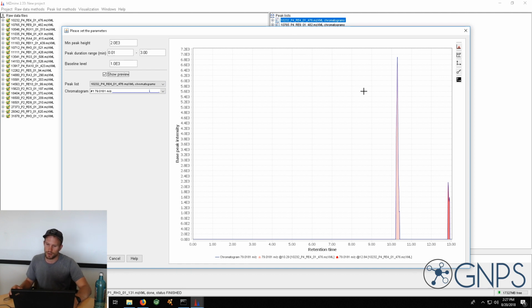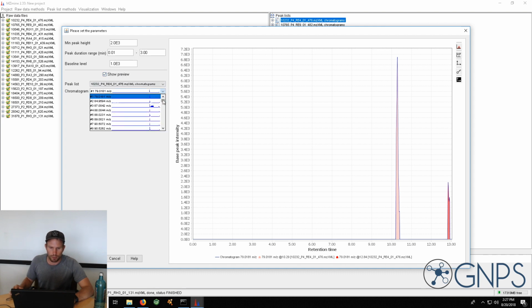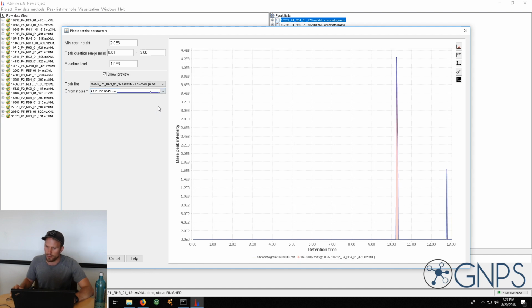So in this case, we would have the pink peak and the red peak detected, very straightforward, baseline separated. This is a very simple example, and apparently the settings we had set fit. But when we move on to some other peaks, we eventually find something like this. Here the first peak was detected, but not the second one, because the threshold was too high. So I might just lower this a little. And then you can see that now this peak would also have been detected.